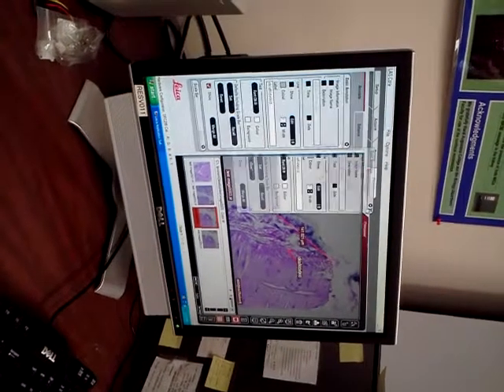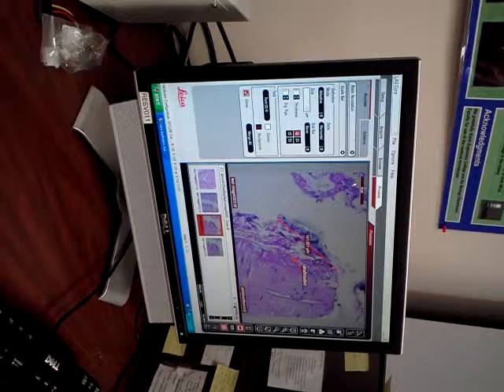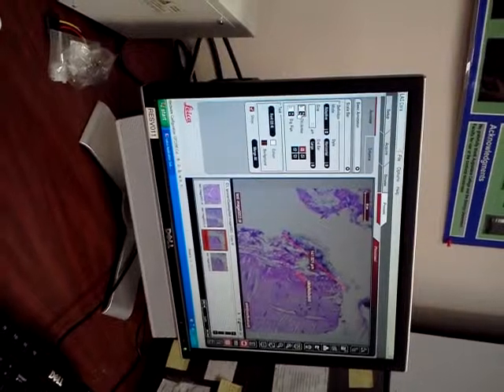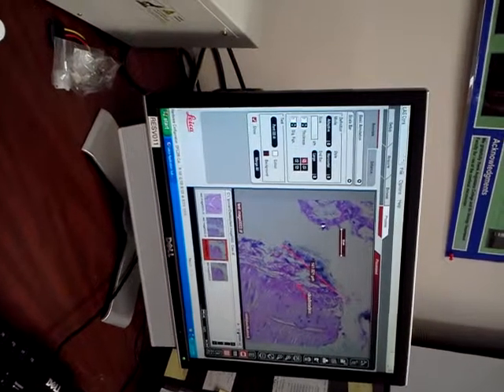There's different ways to go about it. And then scale bar, we're going to activate that as well. Again, it's a little bit small, but upper left. I like to do end bars myself. Make it a little bit thicker. And I can either use the arrows for the different spots, or I can just pick it up and move it wherever I want.